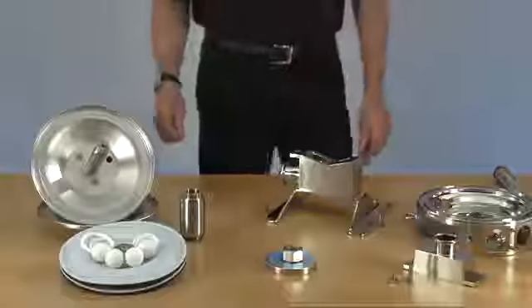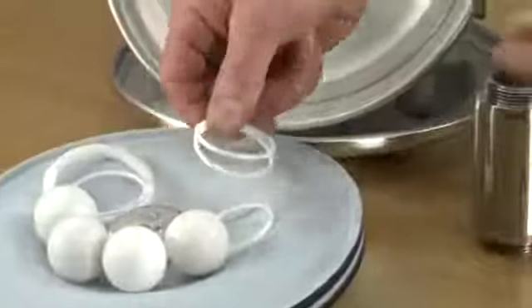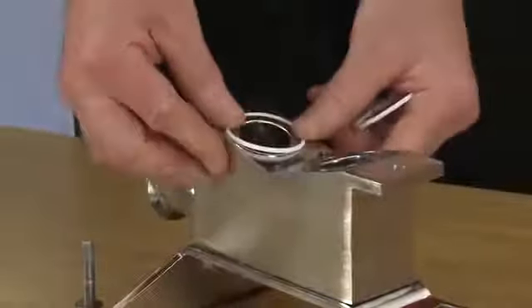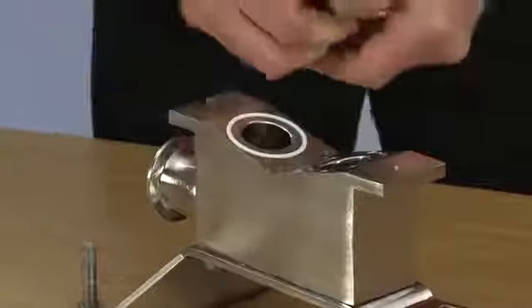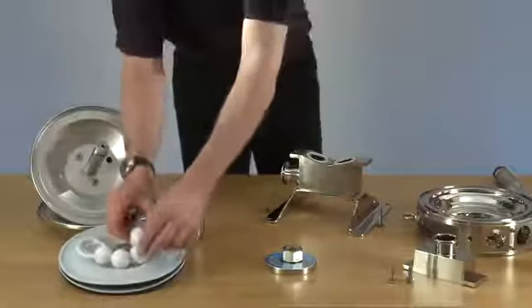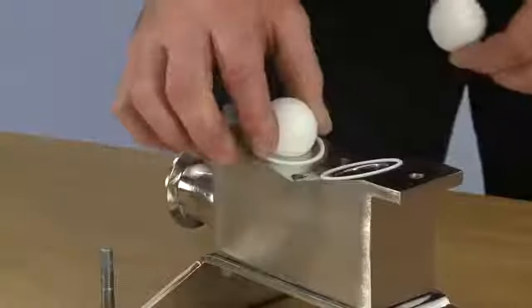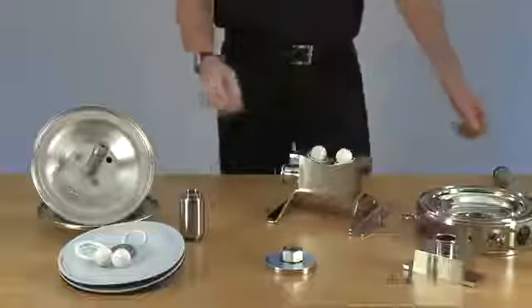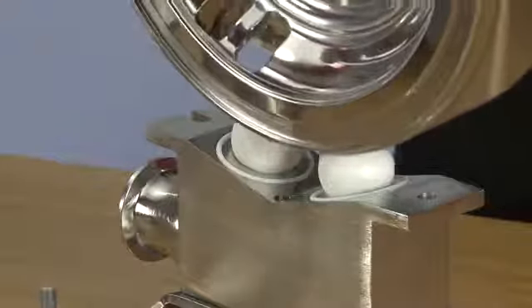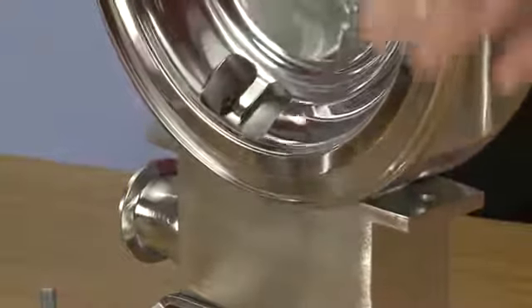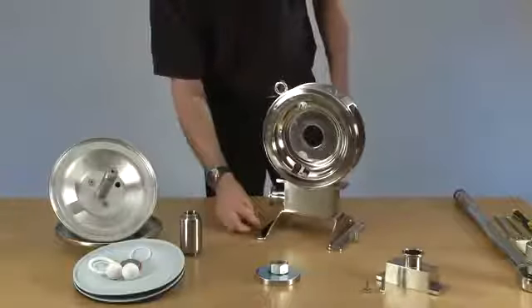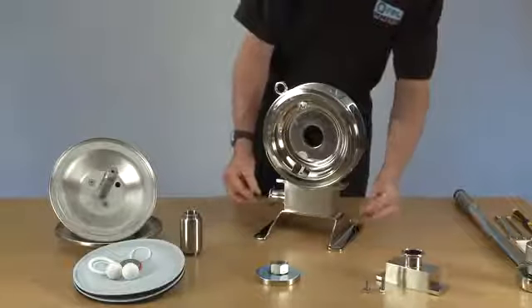Now we're ready to start reassembling the pump, and we're going to start by putting the two seals into the suction manifold. Now we're going to put the two balls in, and then we can replace the body. Making sure it's seated, and then we can replace the two securing screws.